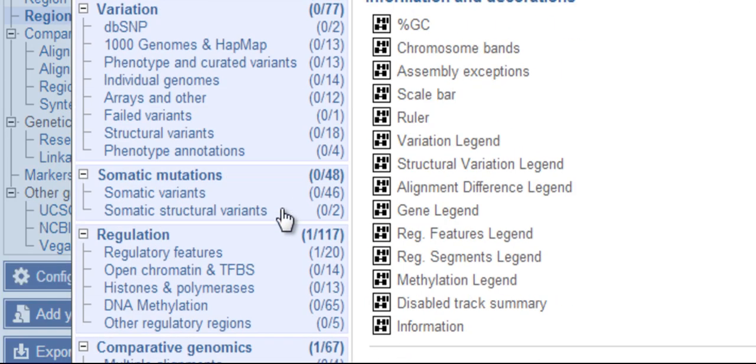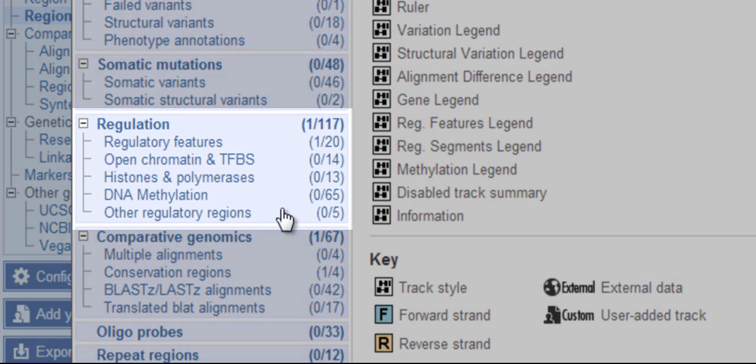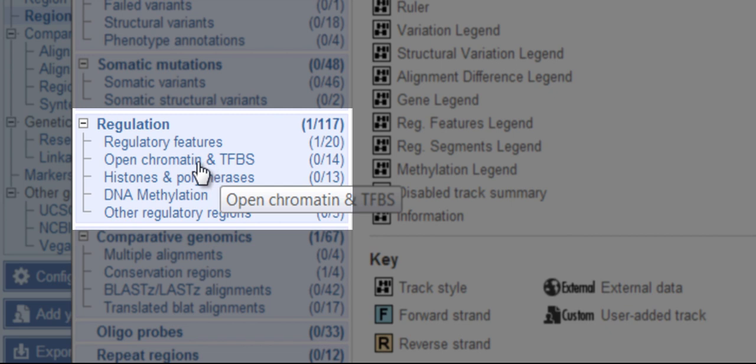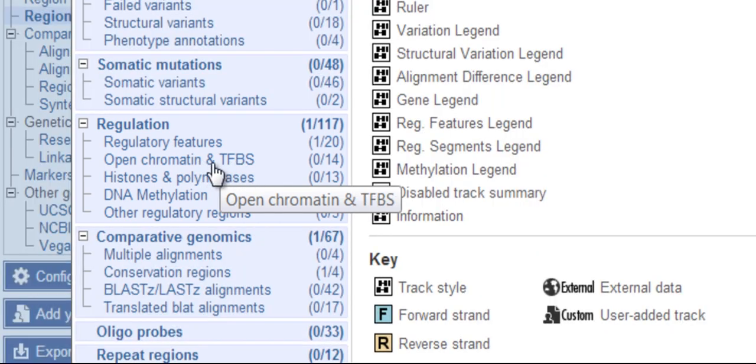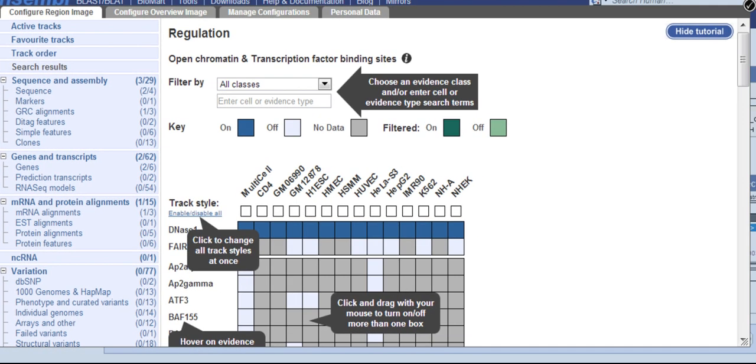Move down to the Regulations section. I'm going to click on Open Chromatin and TFBS for transcription factor binding sites. For now, I'll hide the tutorial.